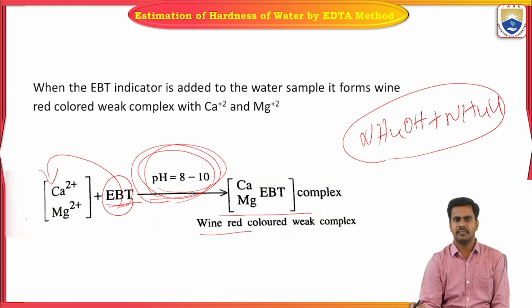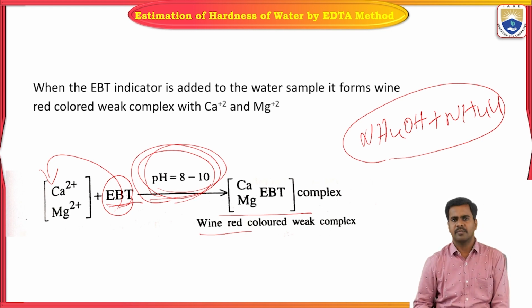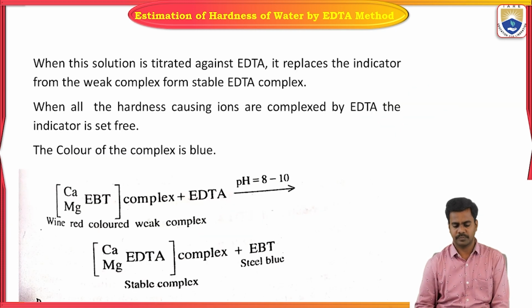Now we have to add EDTA, which is present in the burette, to this complex.